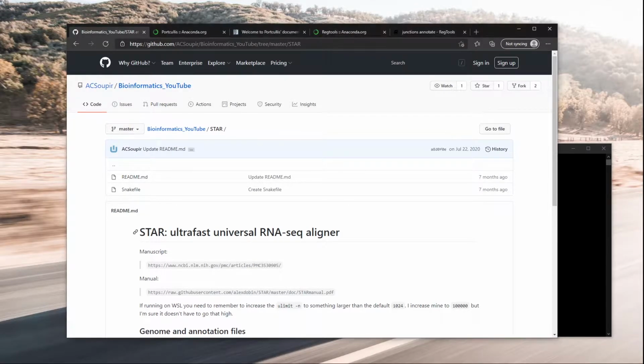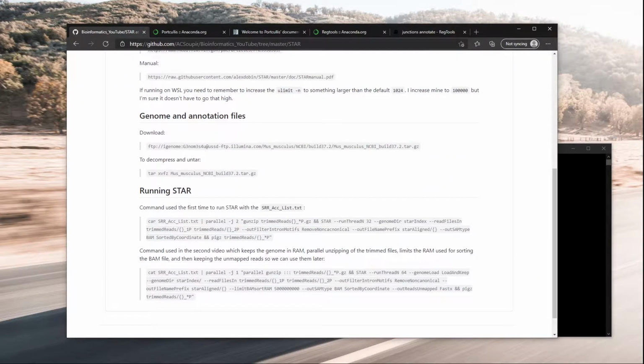Today I want to talk a little about a topic that I've been working on for a while, which is finding new junctions for transcripts in RNA. A big reason to do this is that there are likely isoforms that result in different proteins which haven't been identified yet, because either they're rare, or if they are happening pretty frequently, the RNA life isn't very long, so they get degraded relatively quickly. So it makes them really hard to identify, and therefore, if they're not that common, they're not going to be in the annotation file or the GTF that we use when we're aligning to our genome.